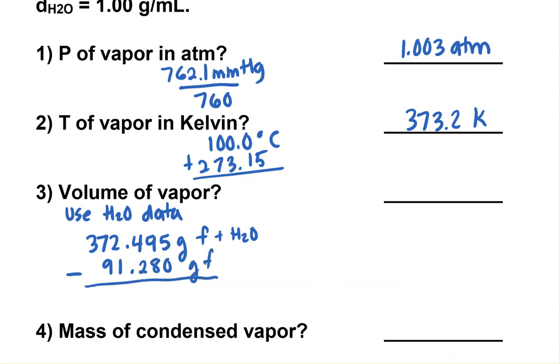And that will tell us the mass of the water. Okay, we need another step here though, because that's the grams of water, and we need to know the volume of water that fit in there.